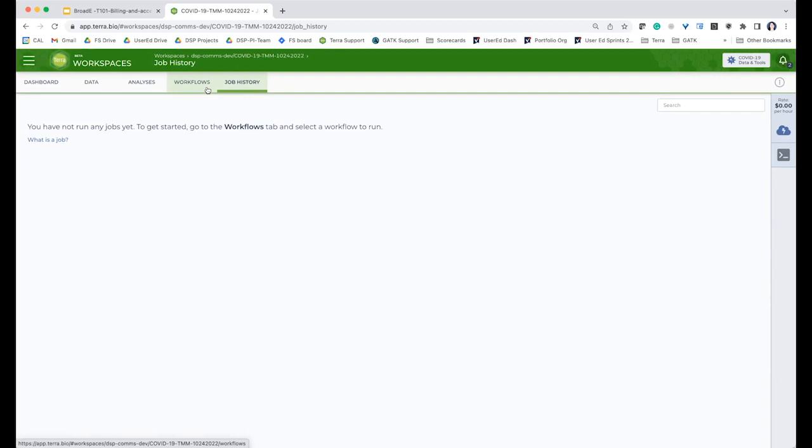But what I would recommend is starting off small. You can keep call caching on, and run your workflow a few times to see how that looks in terms of costs. And in terms of a buffer, it's optional. You don't have to do it. It depends on how close you want to try to estimate your costs.